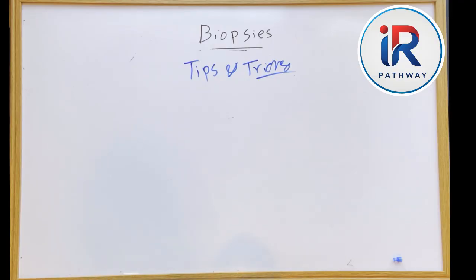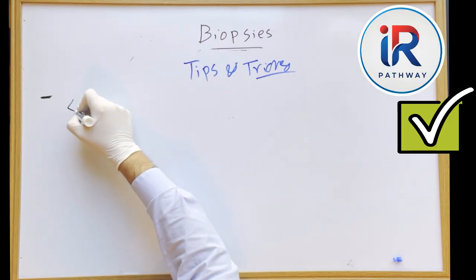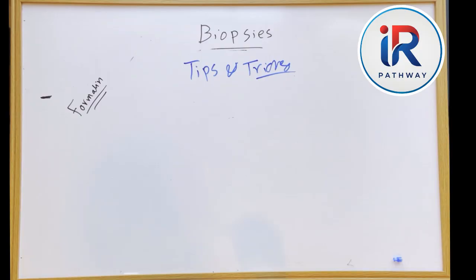So the first thing to remember is that not all specimens are the same. Knowing the clinical suspicion is very important. Most biopsy samples are preserved in formalin for histopathological examination. However, some specimens require special media other than formalin.